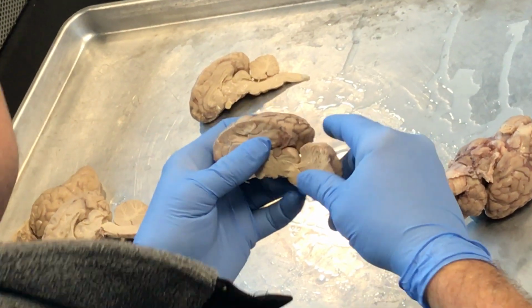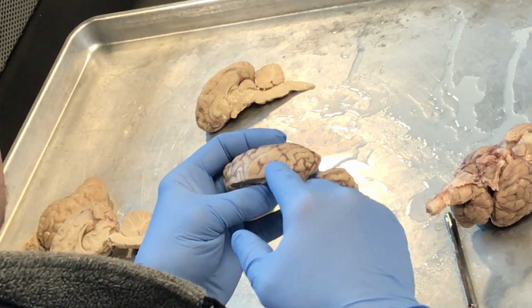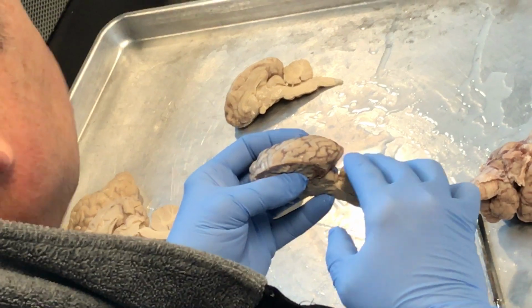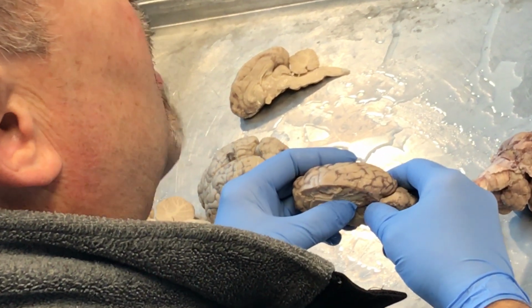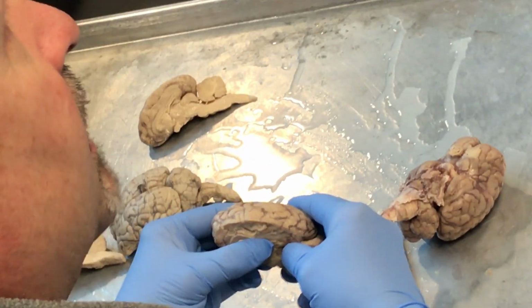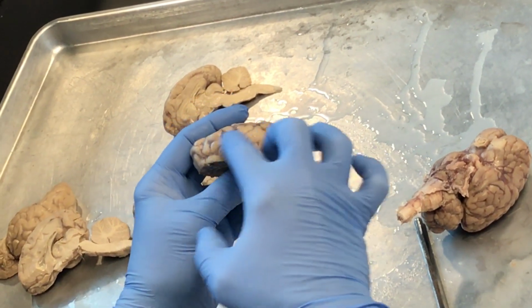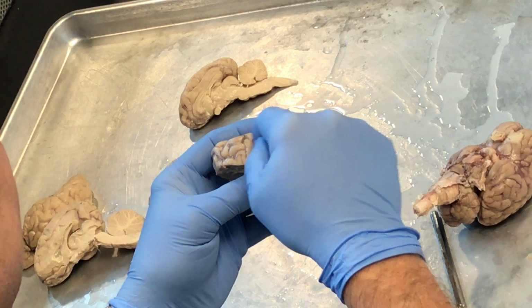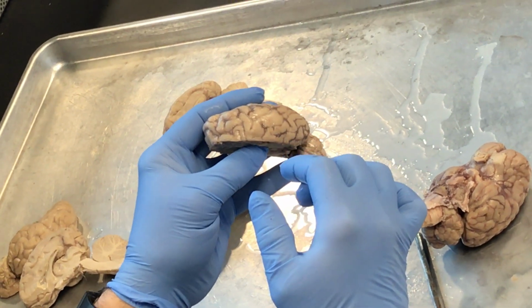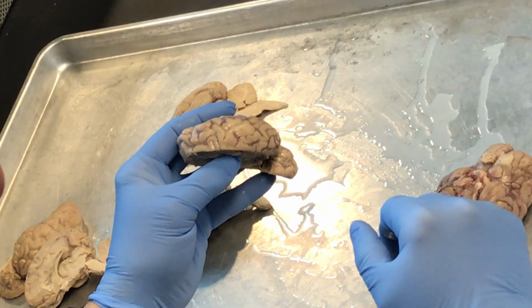And then the last layer is the one that's deepest. It follows all the nooks and crannies. It's below this layer here that you can actually see. It's called the pia mater. Pia mater means delicate mother. So delicate mother follows all these little nooks and crannies down in the deep crevices that you can't see because the arachnoid layer is kind of tenting over the top of it. Okay? How are we doing so far?